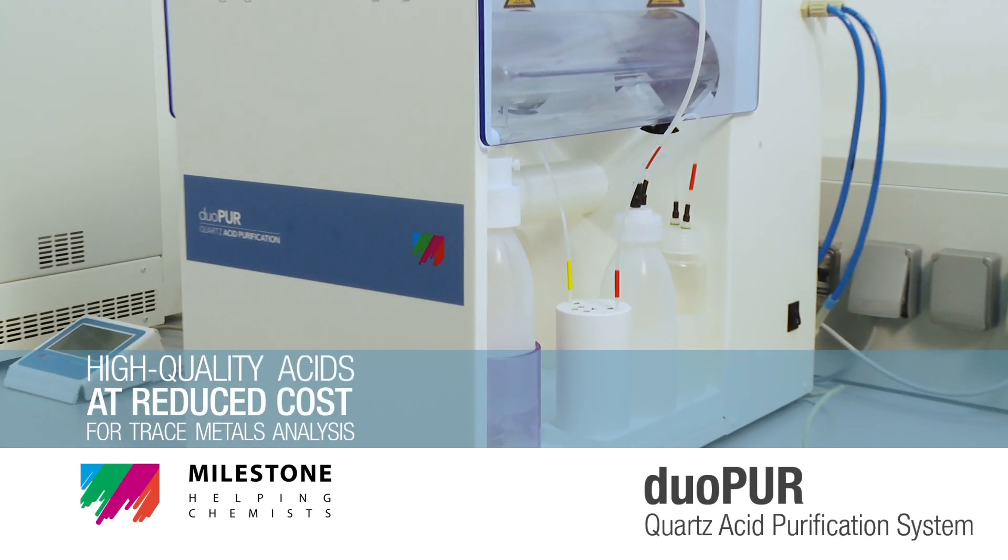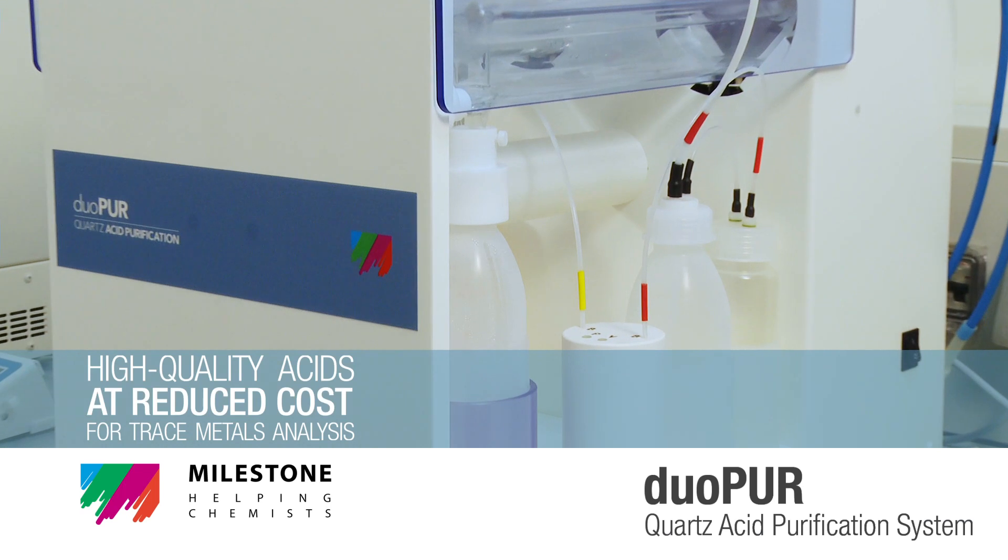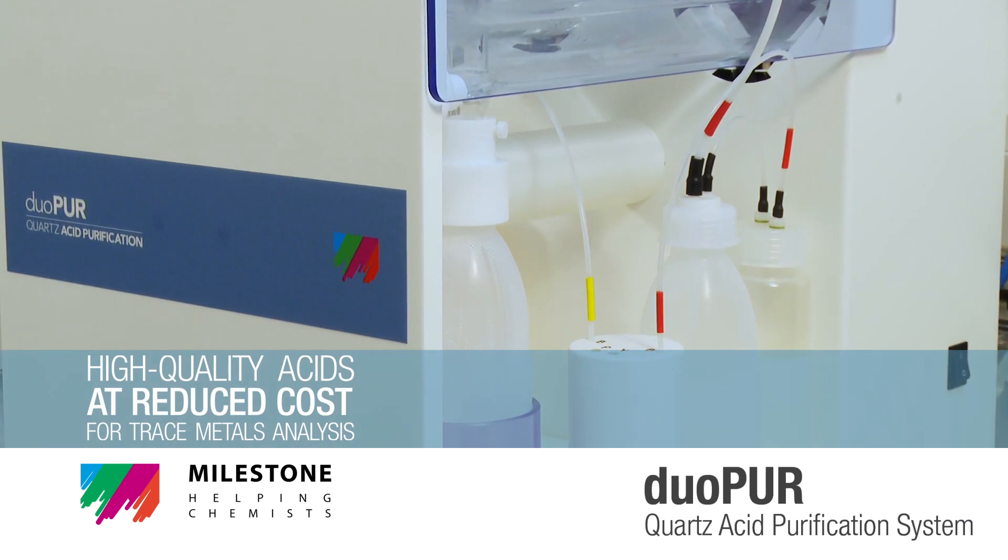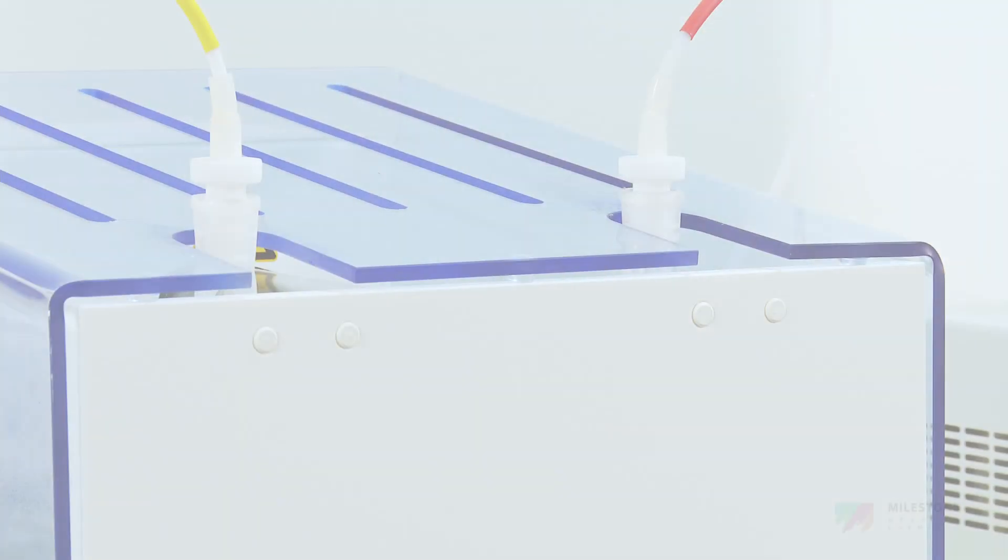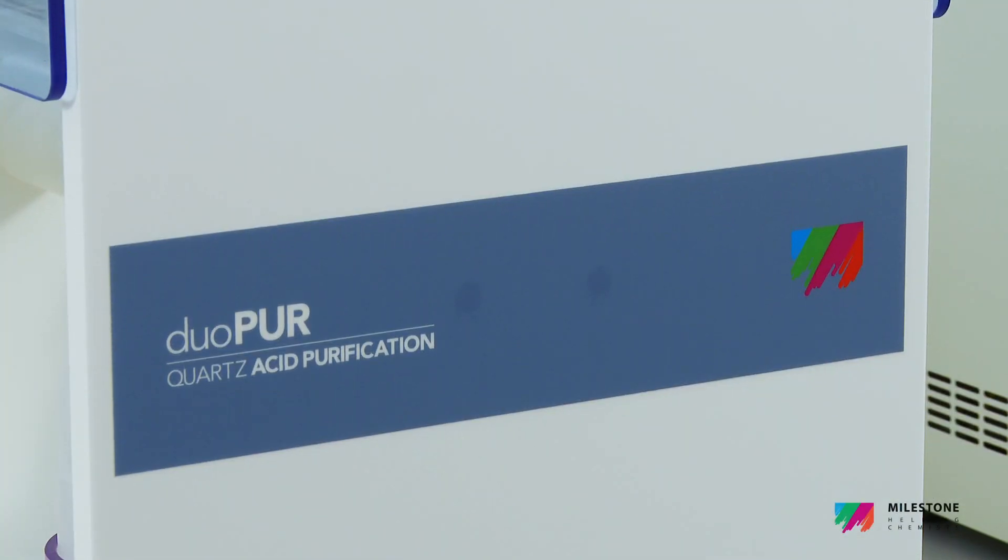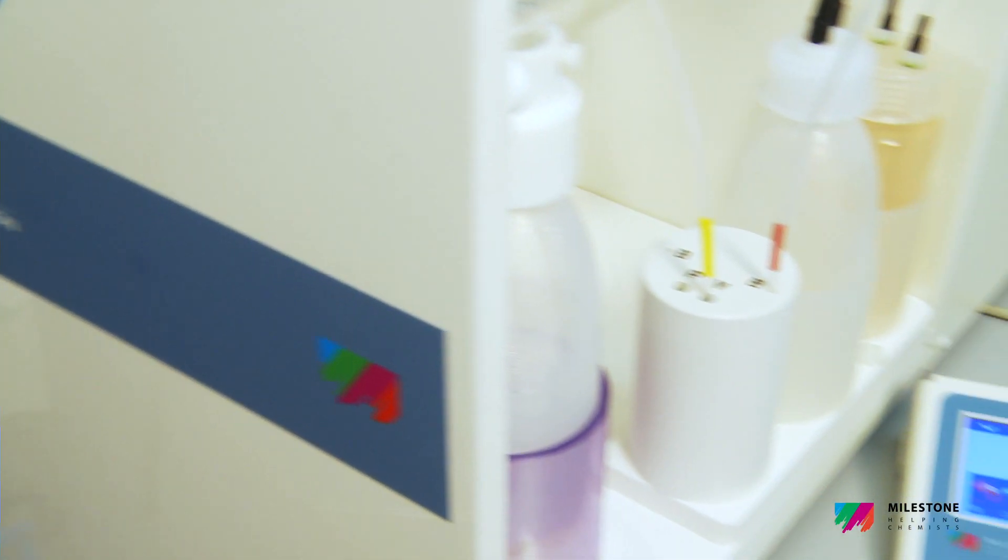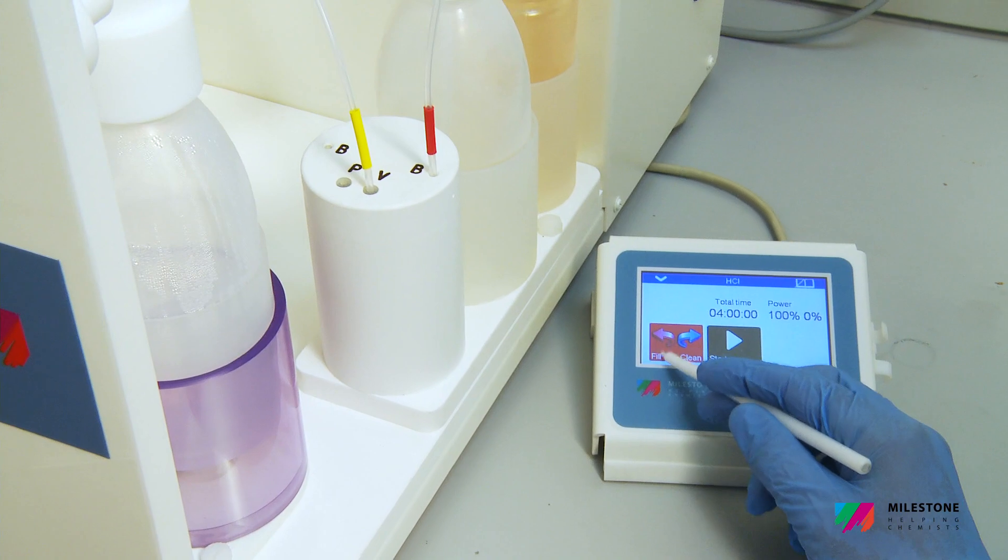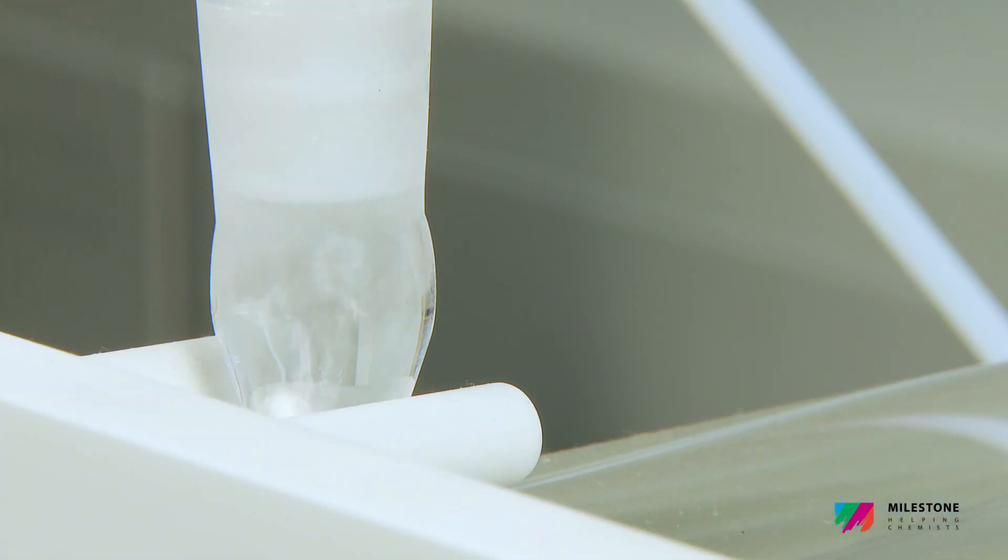DuoPure – High quality acids at reduced costs for trace metal analysis. Sub-boiling distillation has demonstrated to be the best technique and the most cost-effective approach in acid purification.